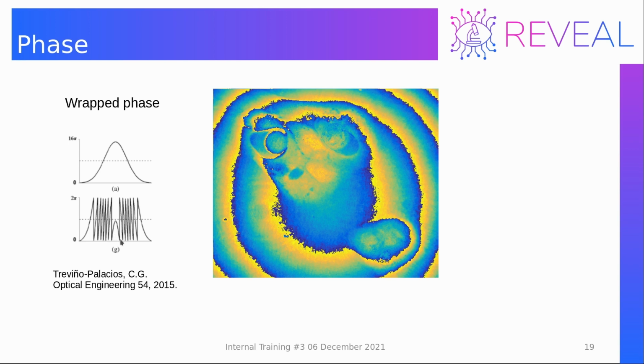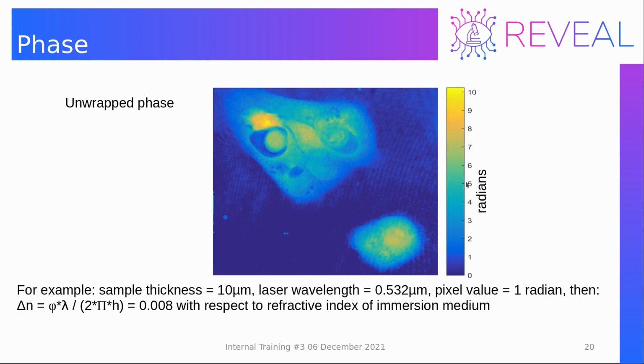But basically what they do is they move this section up so that this distribution becomes continuous, and then they take the bigger region and move it up even more so that it becomes continuous with the next fragment, and so on. It modifies this image until you get a continuous distribution. So after applying phase unwrapping, this is the unwrapped phase that you obtain.